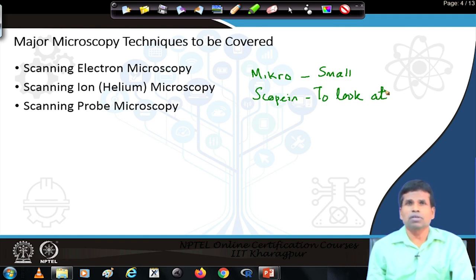Electrons, being a charged particle of very light mass, can be passed through the space if we make it vacuum, and we can change the wavelength of the electron to the desired value by changing its velocity. If we apply potential difference between two electrodes, then the velocity of the electrons will change, therefore wavelength will change, and we can have wavelength much smaller than the wavelength of the light. And therefore, using the electron, we are able to see objects of a much smaller size.